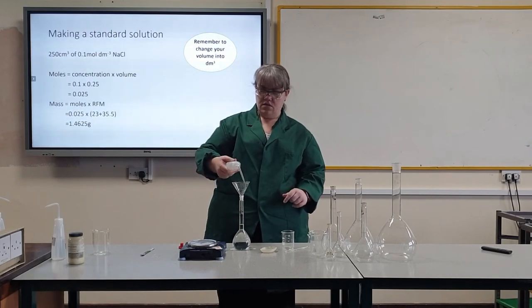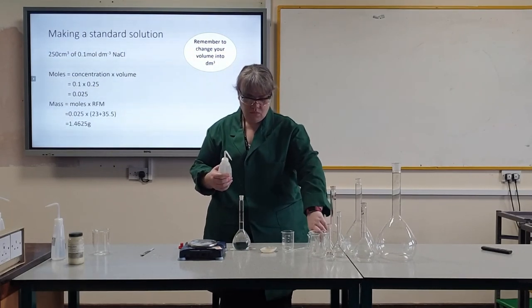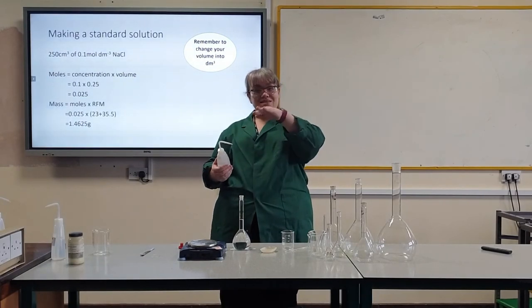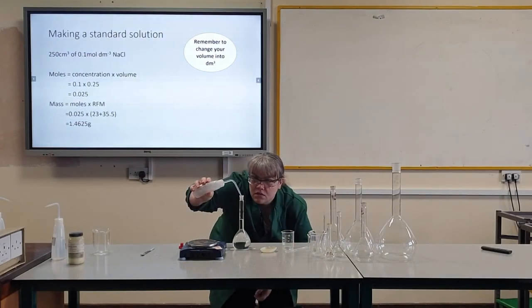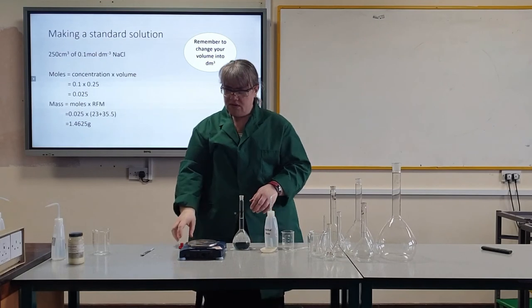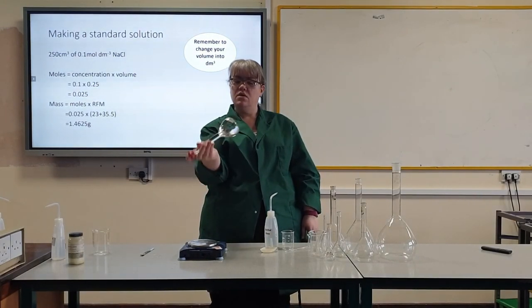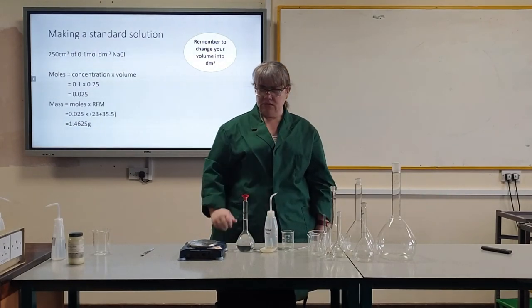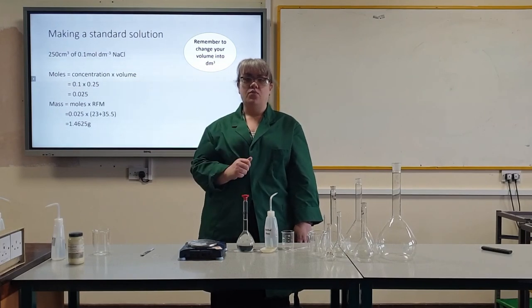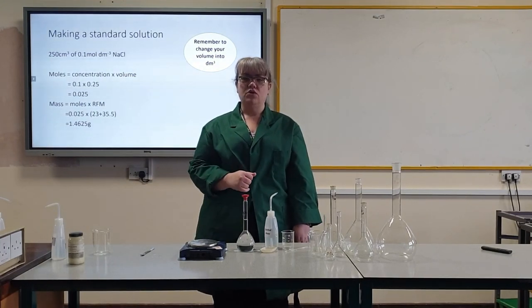I will rinse the funnel. Then, using a wash bottle, I will put in distilled water until the meniscus is sitting on the 250 cm³ mark. Once that's sitting on the line, I put my stopper in and invert it a couple of times. Leave it to stand for a minute or so and just double check that the meniscus is still sitting on the line. If it's not, top it up with a couple of drops. I will then use the mass that I recorded to calculate my actual concentration of sodium chloride, and that is now ready to use.